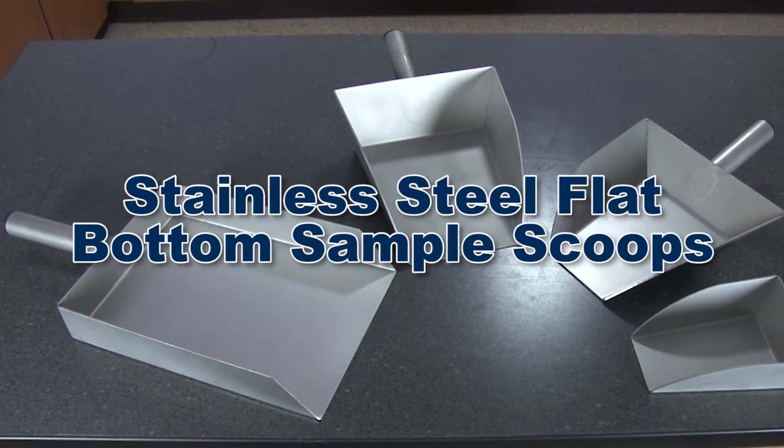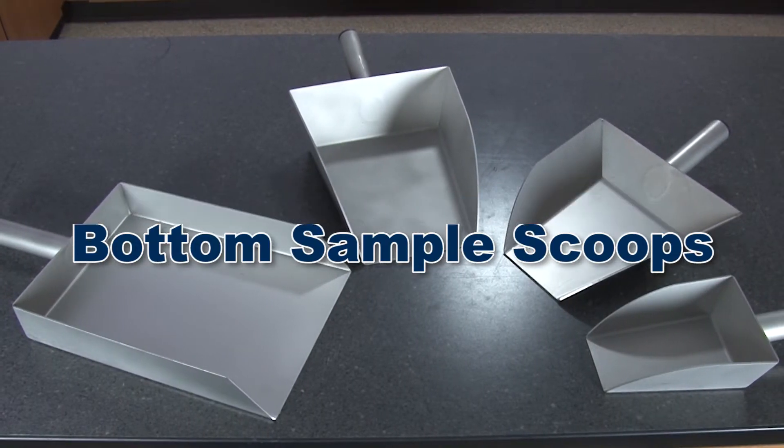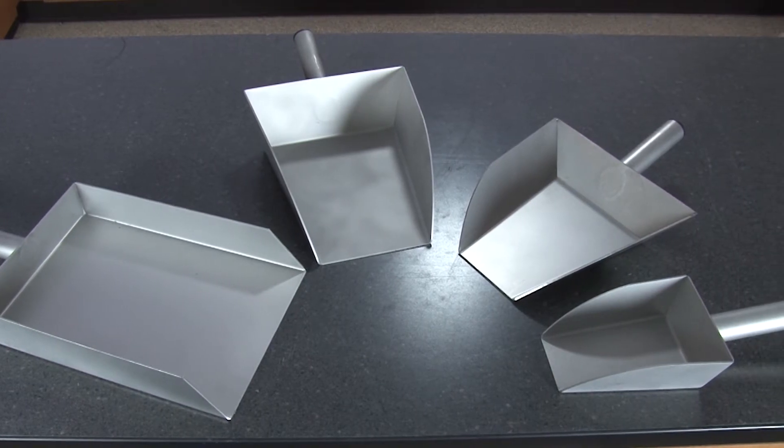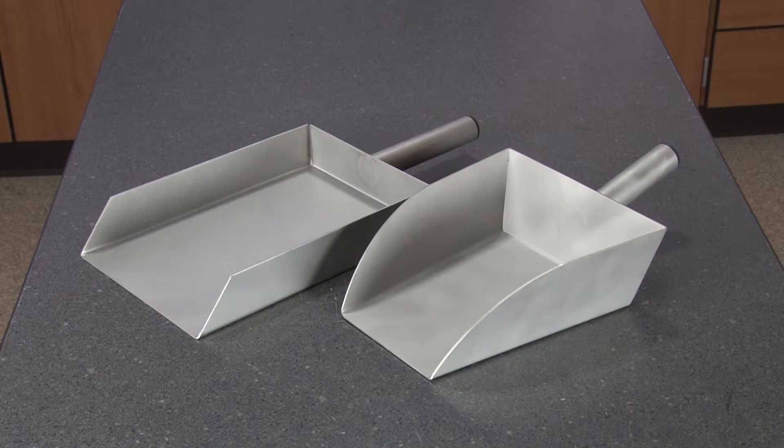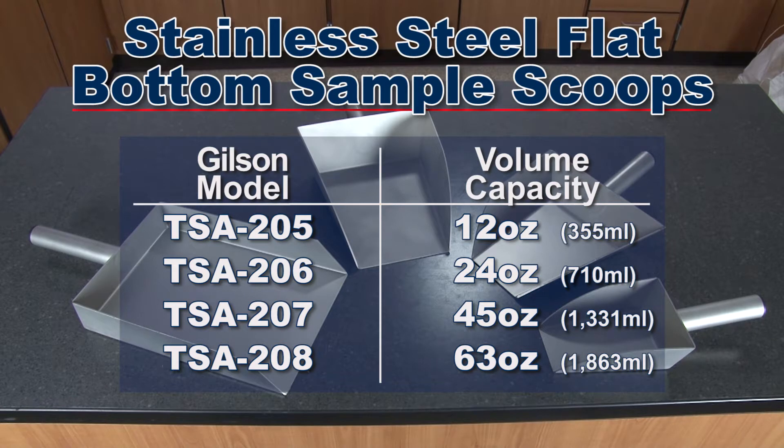Gilson offers multiple stainless steel flat bottom scoops that are constructed with corrosion-resistant stainless steel and are ideal for lab or field handling of sample materials from the bottom of a pan. These sturdy scoops come in several volume capacities.